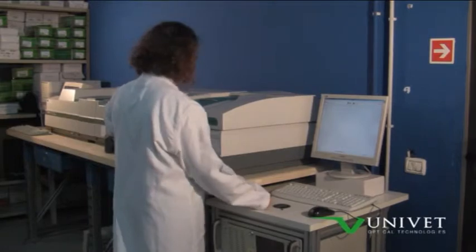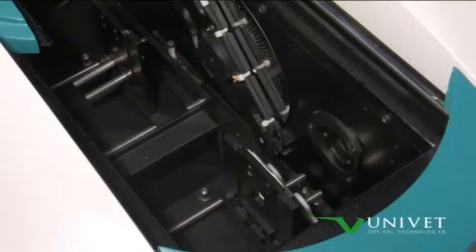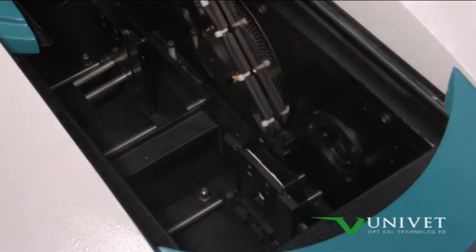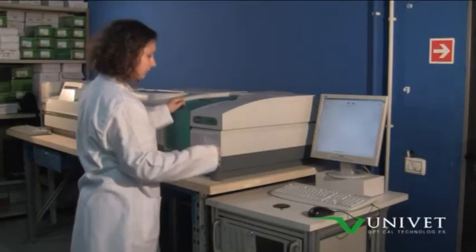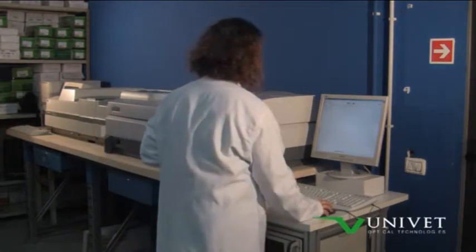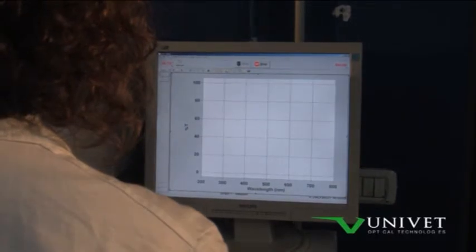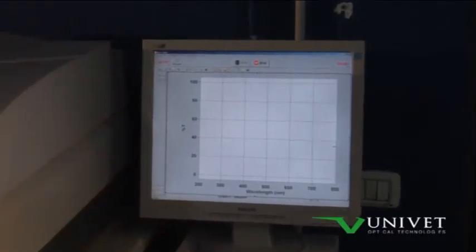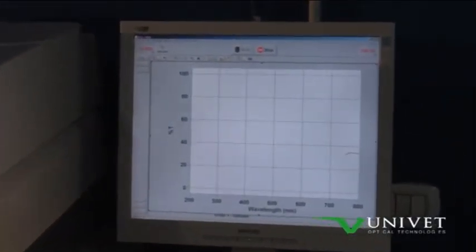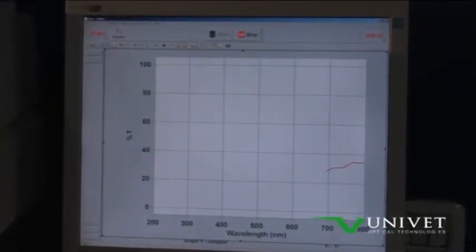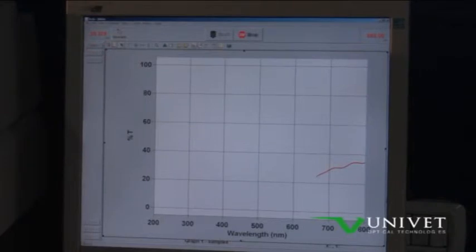Each type of optical radiation source to which workers may be exposed has specific emission characteristics. For this reason, each filter is designed as a function of the emissions from which it must provide protection. The measure of the absorption of an optical filter is done by using an instrument called spectrophotometer, which is capable of measuring the percentage of light that passes through the lens for each value of wavelengths.